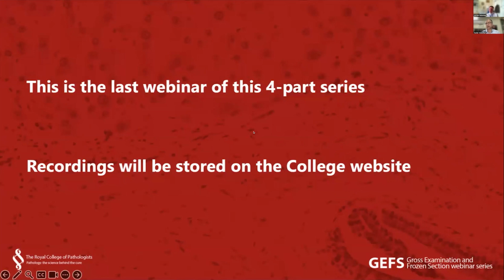Although I also alluded to the fact that it wasn't that long ago, in previous versions of TNM, they would have been included if they were over 3 millimeters across. So if you're doing a study where you're looking back retrospectively at cancers removed several years ago with different versions of TNM, what was called a lymph node under a different version of TNM wouldn't necessarily be called a lymph node under TNM8. Yeah, that's so. Thank you. I took the rationale from TNM5, and that was what I was coming from.